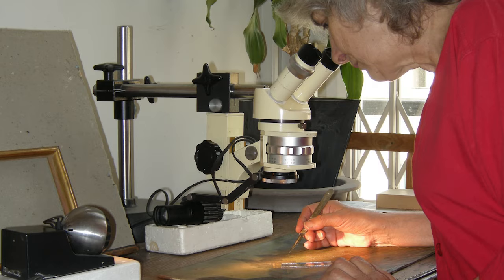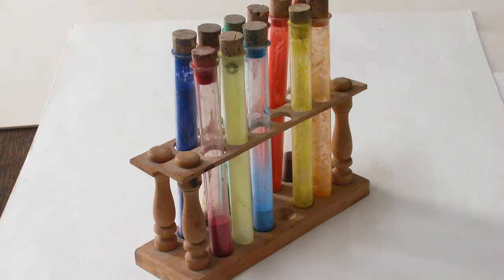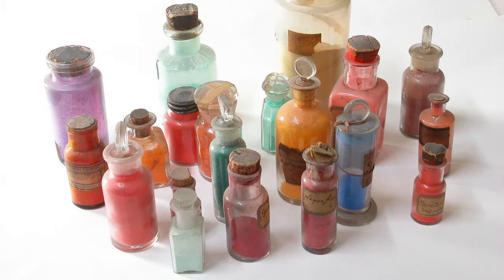In some cases, this analysis can be carried out by other non-destructive means without the need for samples, for example by using X-ray fluorescence. This analysis plays a role in authentication. In identifying a pigment or binder, we tie the work to a particular moment of creation. The process helps us to situate the artwork in time, as the chemical components of pigments and binders are generally characteristic of a particular era. It is often in investigating an anachronism that evidence of forgery is uncovered, and vice versa, the presence of pigments that are compatible with the period in which a painting was made can securely locate the work in a given era.